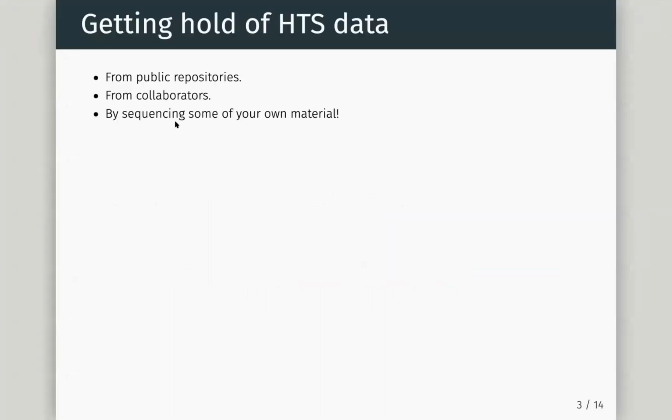But what's really important is actually getting a hold of some high throughput sequencing data. And as some of you have mentioned in the chat, you already have data and you've come to this course hoping, and I think we can process or analyze your data following the methods that we have in class. Okay.